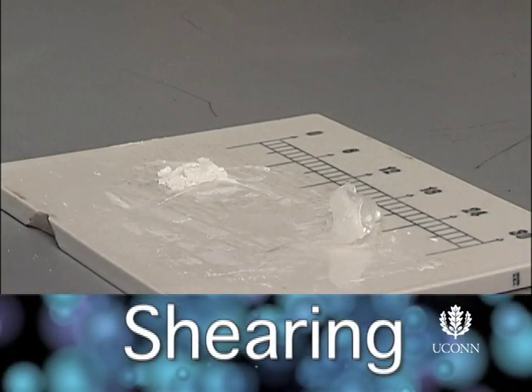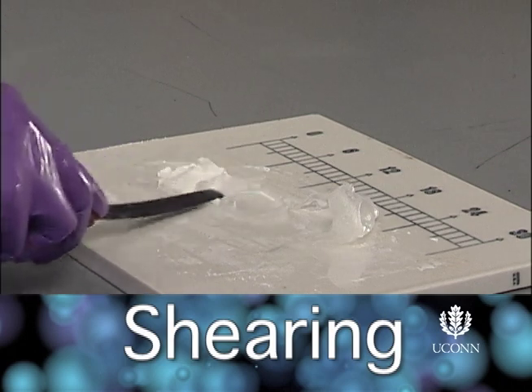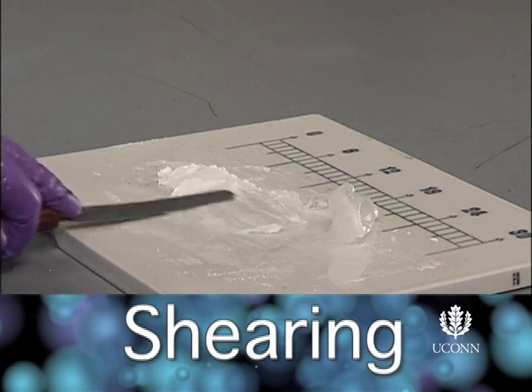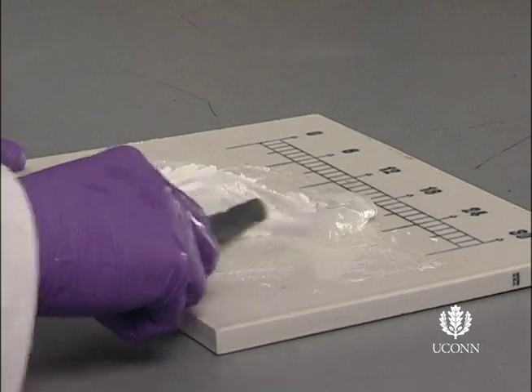It is best to mix the ointment by picking up the base with a medium-sized spatula and then spreading the ointment across the entire length of the work surface. This process causes shearing and is used to further reduce particle and agglomeration size.